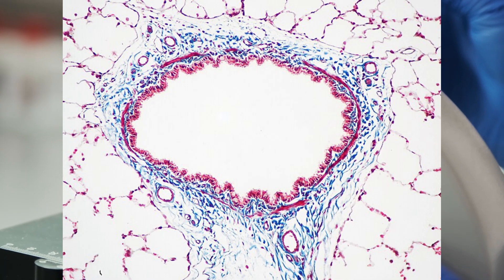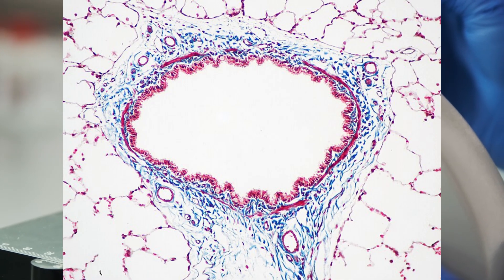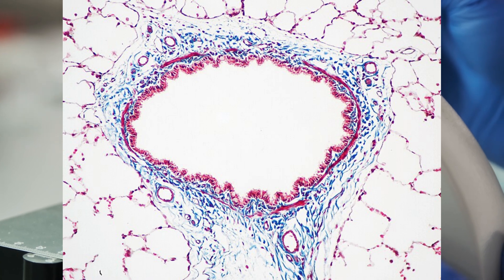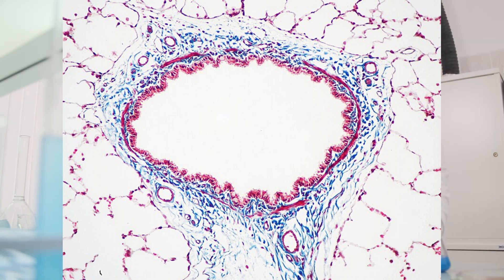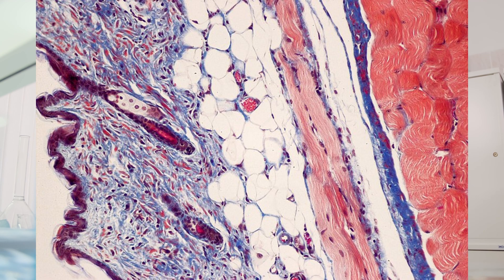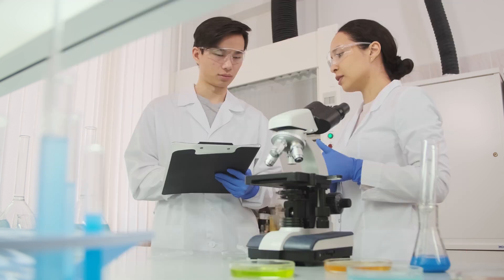Masson's trichrome is, unsurprisingly, a multicolour result when used — the name kind of gives that away. What makes this useful is that it has a red counter-stain and a blue stain, and you can get a mix in between depending on what you're looking at. It is notably helpful as tissues will be stained a reddish colour, while the bluish colour will tend to stain the fibres around them.